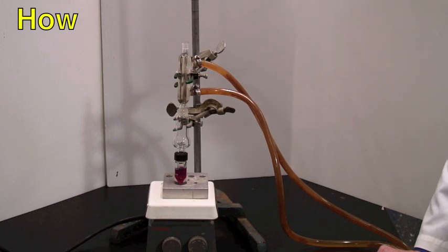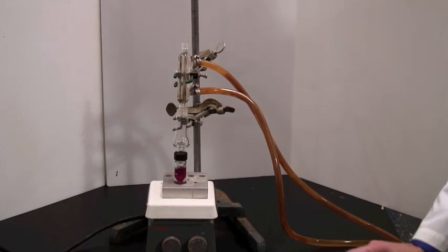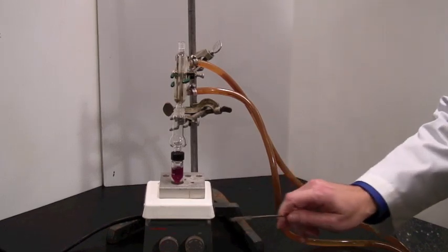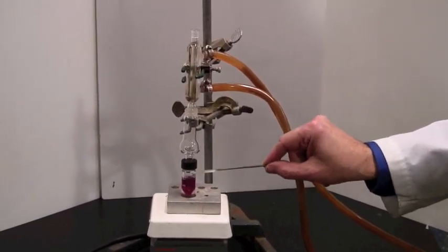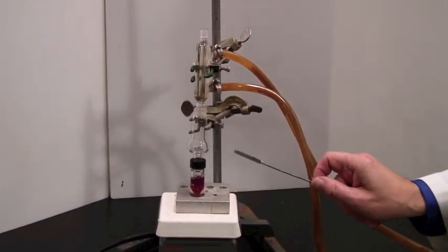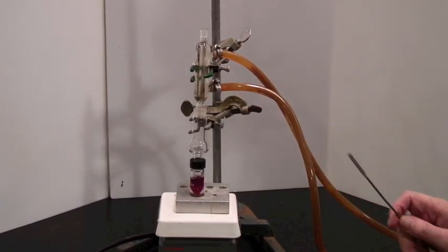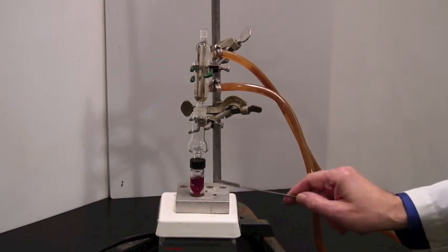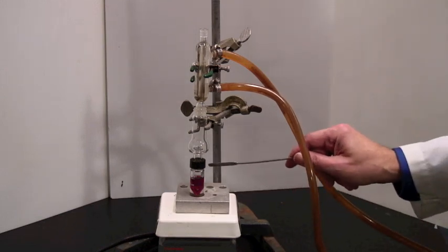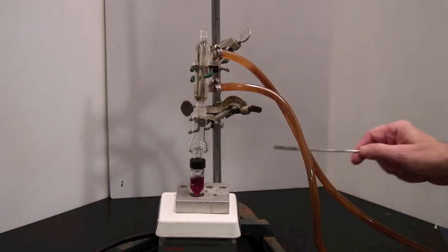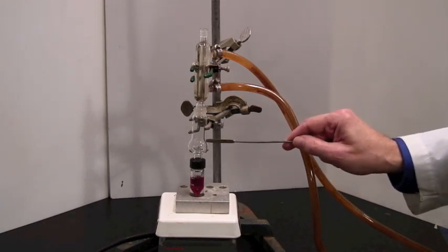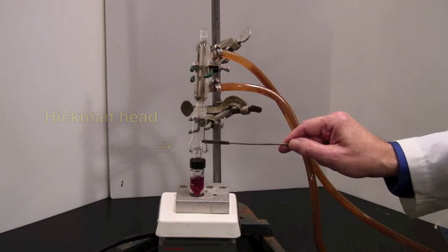Here is a microscale distillation setup ready to go. We have here, obviously, the hot plate at the bottom, and a heating block. This is a conical vial. There's a spin vane in there. Sometimes you may have a round bottom vessel here, depending on whether you've got more liquid or not. It's held in place with a threaded cap.